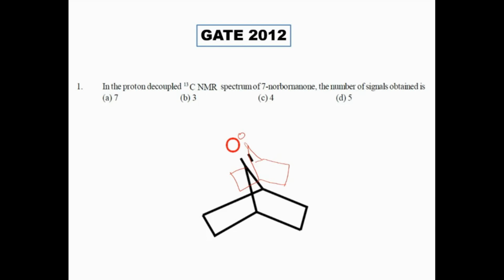Ma'am, we can have a plane of symmetry along. Okay, so I can cut the molecule like this. Okay, like completely like this. Yes. ஒரு molecule சரி அப்படி C double bond இல இருந்து ஒரு plane எடுத்து வந்து அப்படி கட் பண்ணலாம். வேற எப்படியாச்சும் கட் பண்ண முடியுமா? Can I cut in some other way? Probably along the triangle. Along this plane, ma'am. Yes.